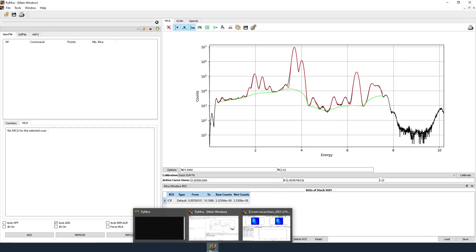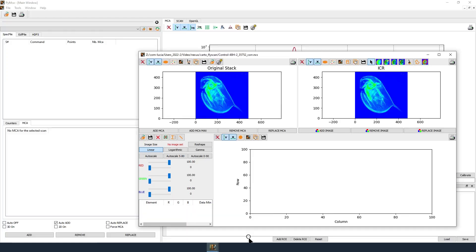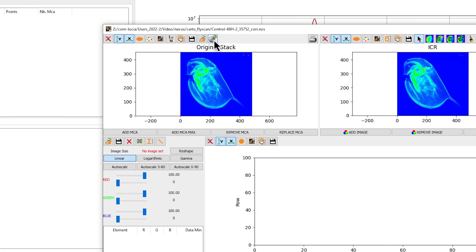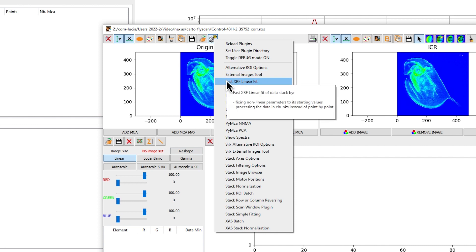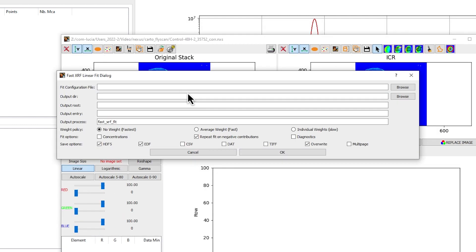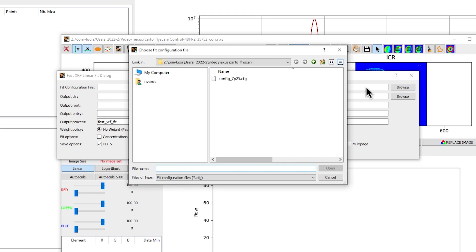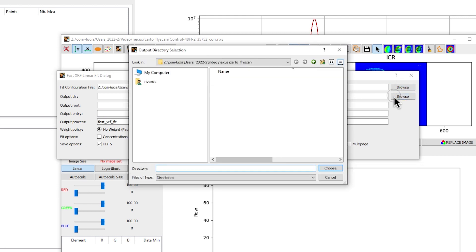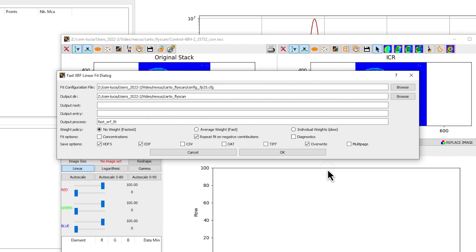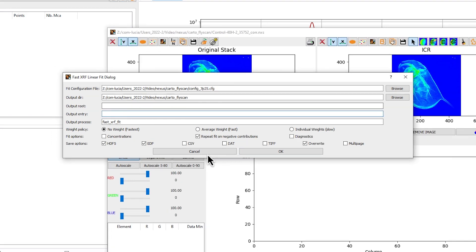In the map window, click on the Call then Load Stack Plugins icon and select Fast XRF Linear Fit. In the Fast XRF linear fit dialog box for fit configuration file, select the configure file previously prepared for the map.